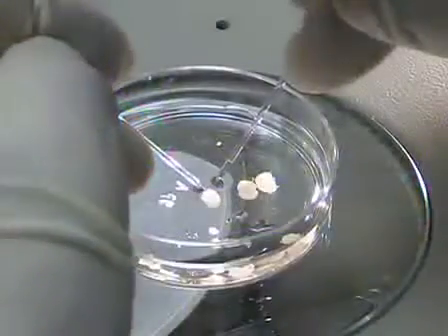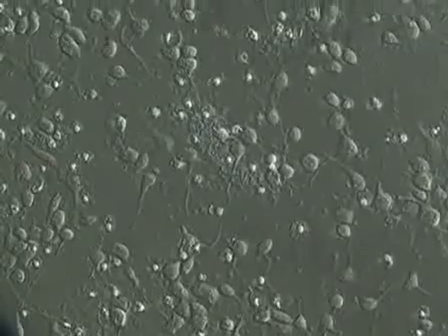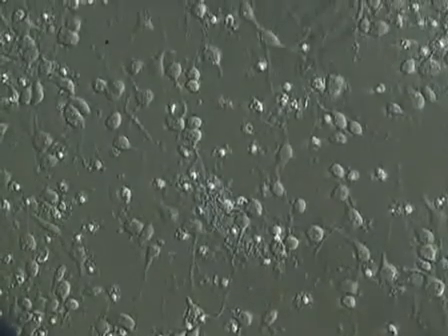The nice thing about these cultures is that it's an adaptation of the Banker protocol, but we grow these cultures in the absence of glial feeder cells, which makes it a lot more convenient and the cultures are usually more rich in neurons than in glial cells. So let's get started and I'll show you how we prepare those neurons.